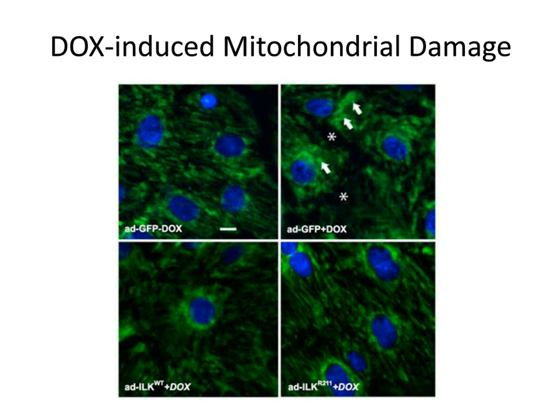Expression of both wild-type integrin kinase in the bottom left and the constitutively active version in the bottom right attenuated these changes significantly. So now we've shown that integrin kinase can improve calcium cycling, SERCA2A activity, arrhythmias, contractility, and also now preserve mitochondrial function. All of these are important, obviously, within the organ as well, and something we see in clinically important cardiac disease.